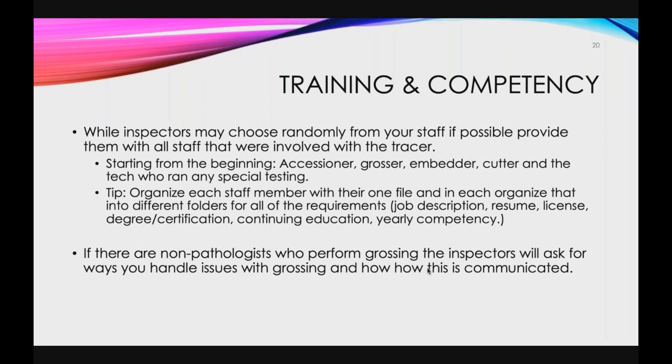You don't want to be trying to find things, thinking, did I put this job description in here? I know it's in here. Oh, the license, it's easy. I know my license is in there. Well, no. Is it a renewed one? Sometimes they don't give you the renewed one. They forget, so it's always good to make sure you look through all of that. Even if it's once a year, you're not asked to do more than that. Once a year, you pull out the file.